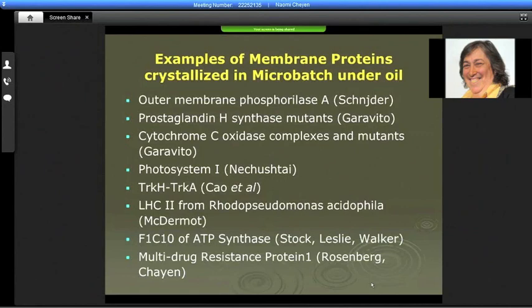And then if the oil is gradually absorbing the excess detergent, it allows the protein to gently come out of solution. Now, we don't know whether that is true or not, and people have tried to check it. The jury is still out on it.